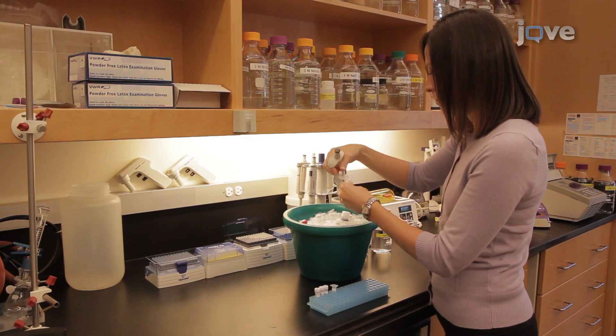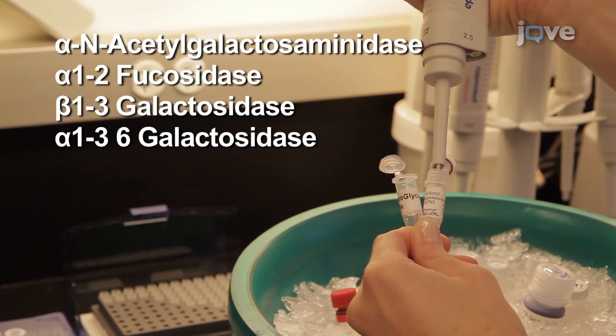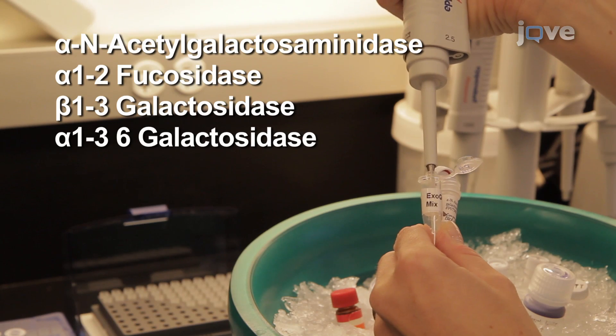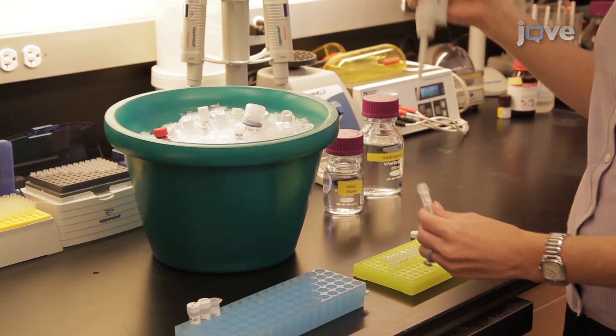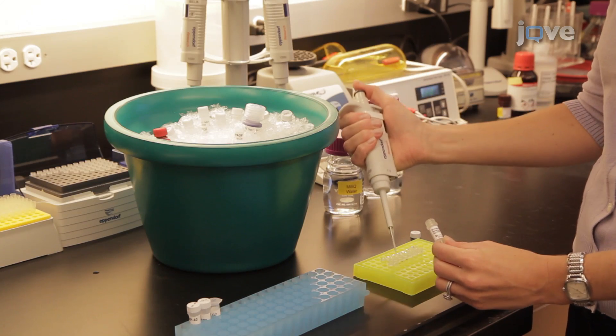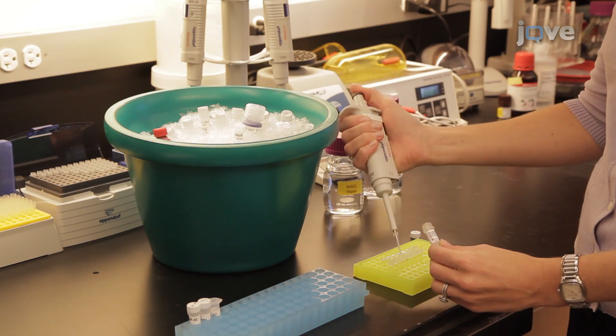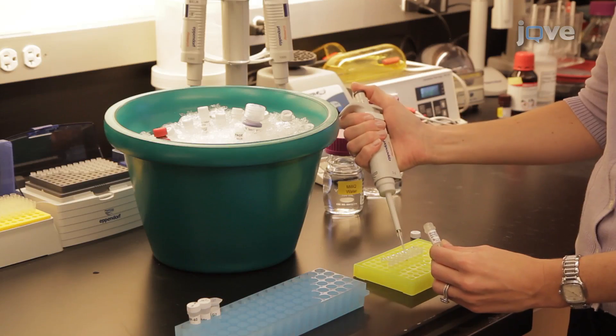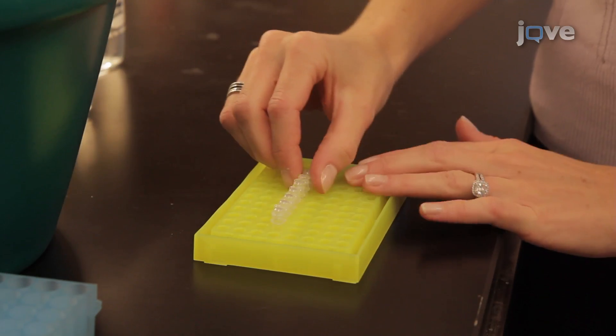Prepare the exoglycosidase mix by combining 2 microliters each of the 4 exoglycosidases. Next, add HCG beta and 10X glycoprotein denaturing buffer to 7 numbered PCR tubes as indicated in the written protocol. Cap the tubes and mix gently.